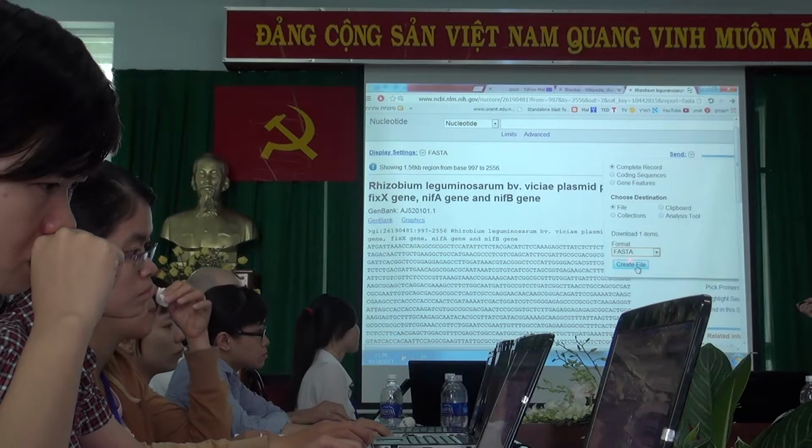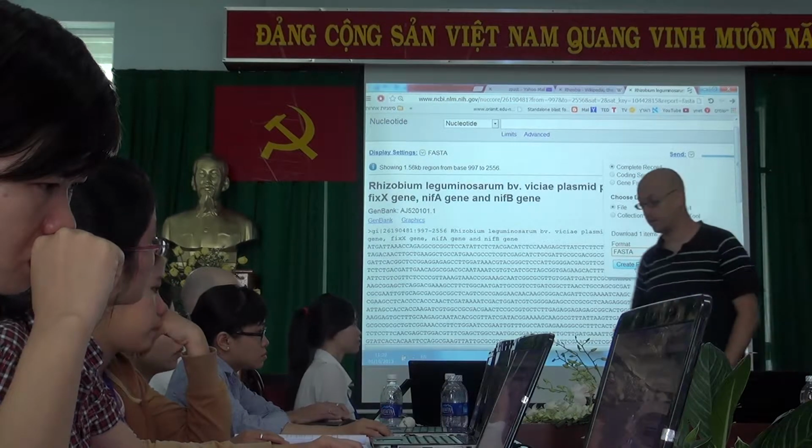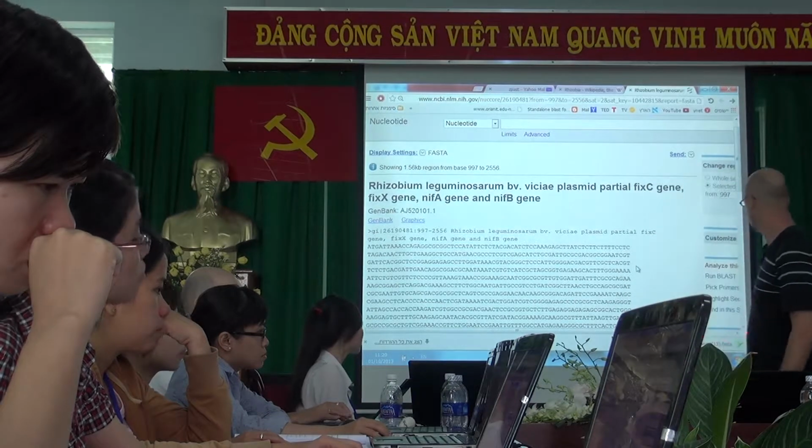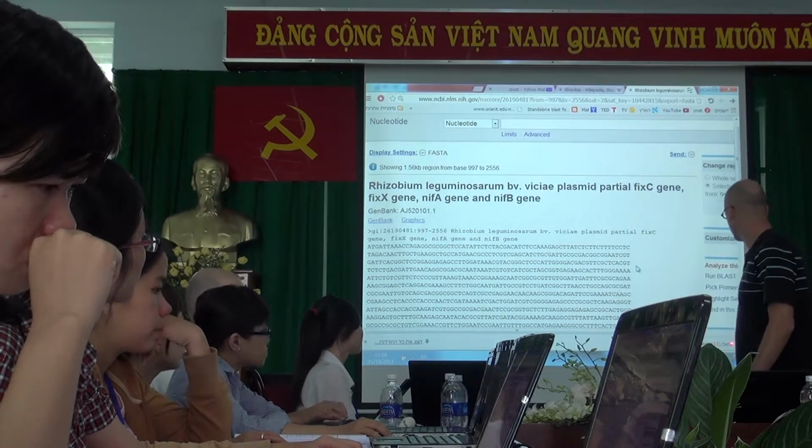So we choose FASTA and we click Create File. And you see here, now we have the sequence.